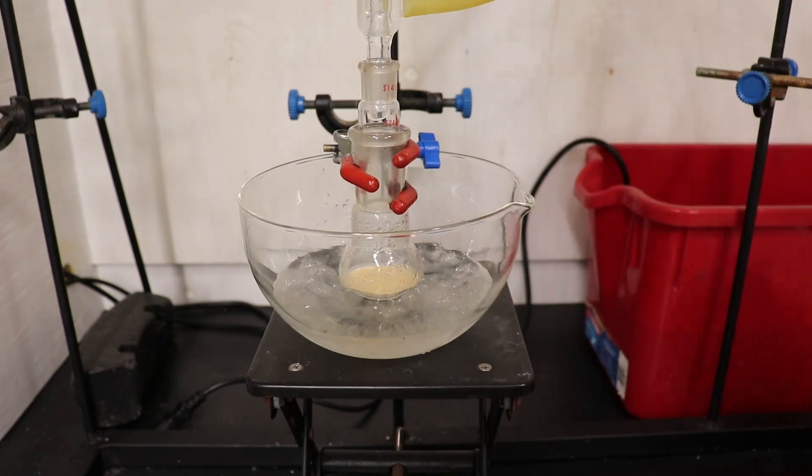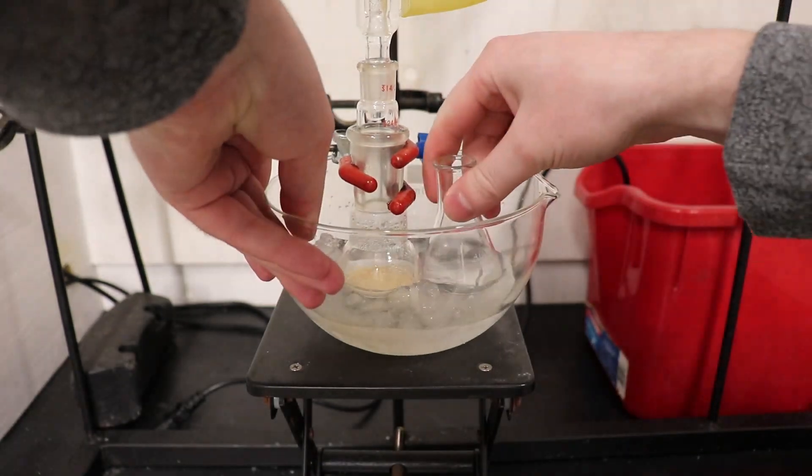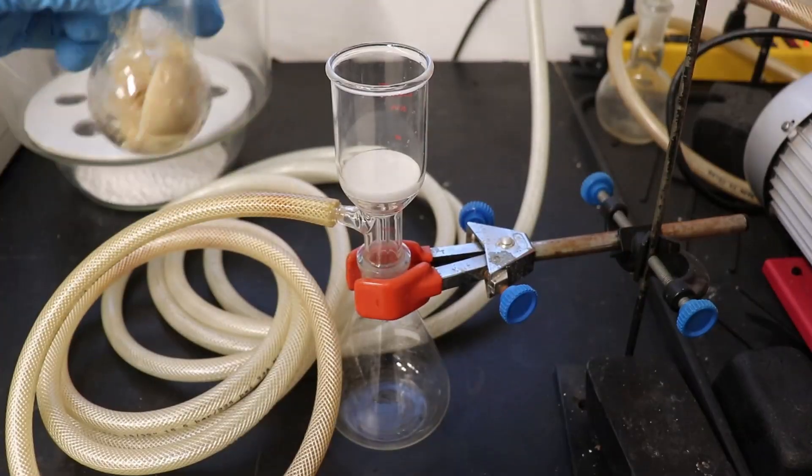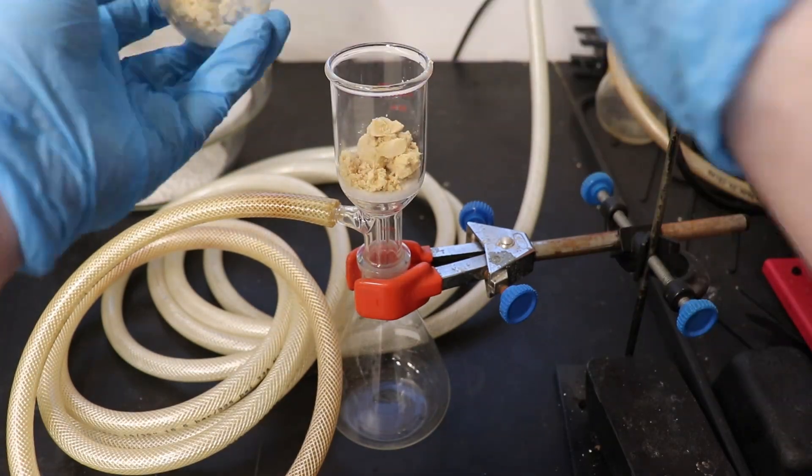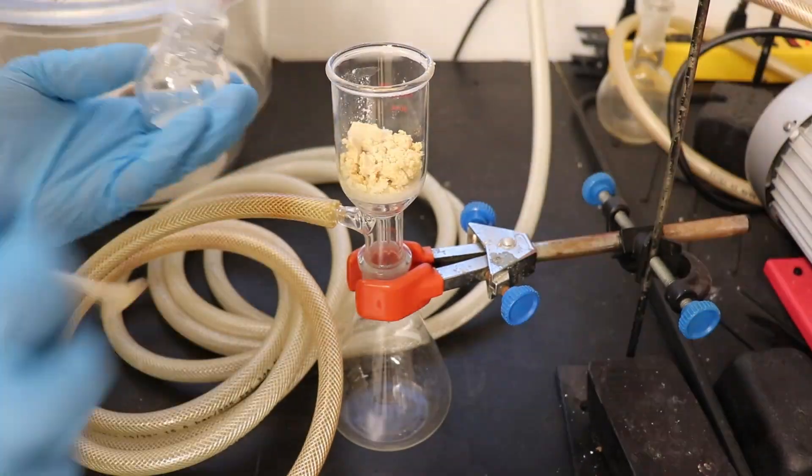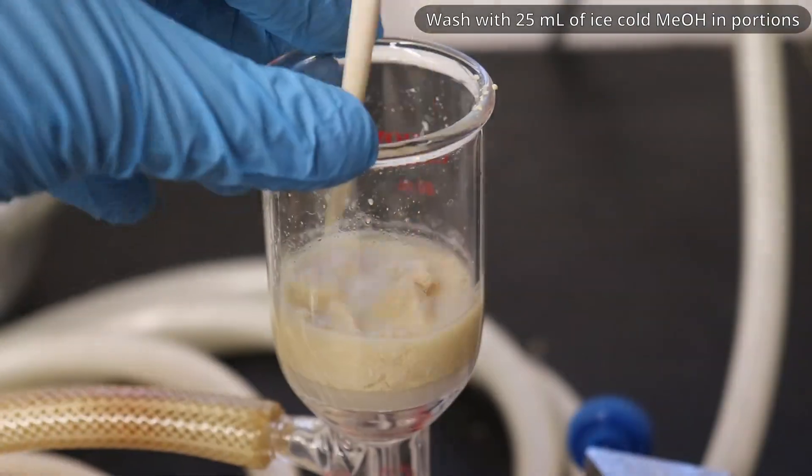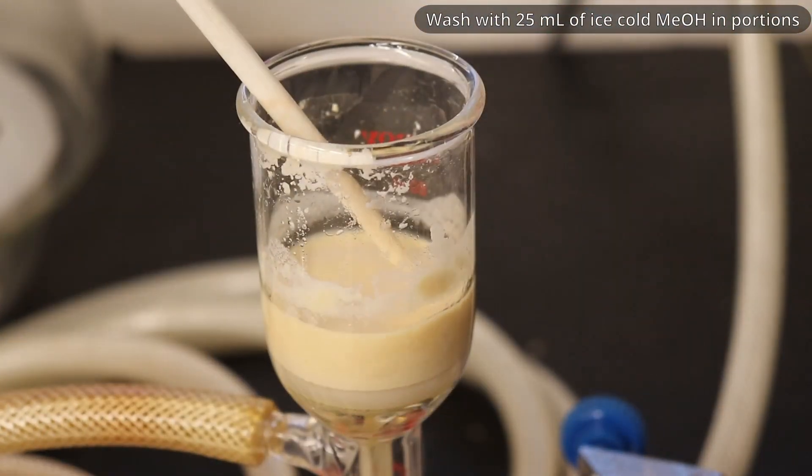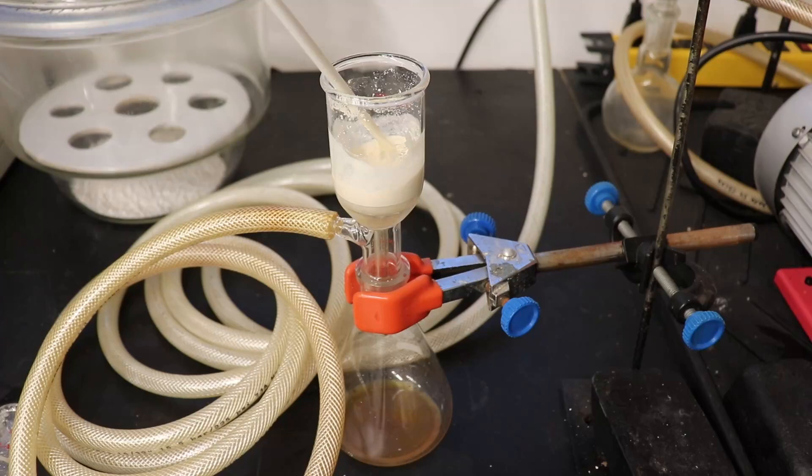The flask was then cooled in an ice bath, alongside with 25 milliliters of methanol. The pasty solid was broken up with a spatula and transferred into a glass-fritted funnel. Then it was washed in small portions with ice-cold methanol, with a total of 25 milliliters being used.